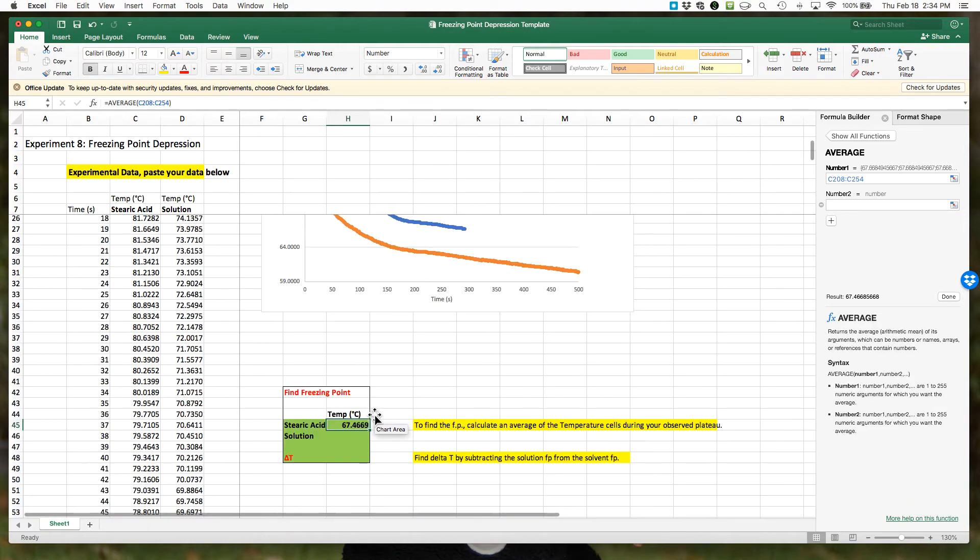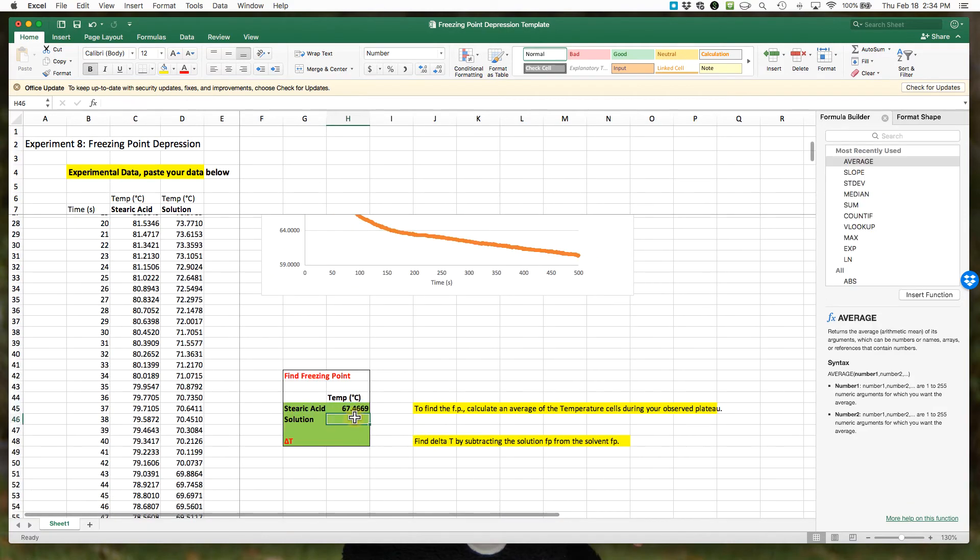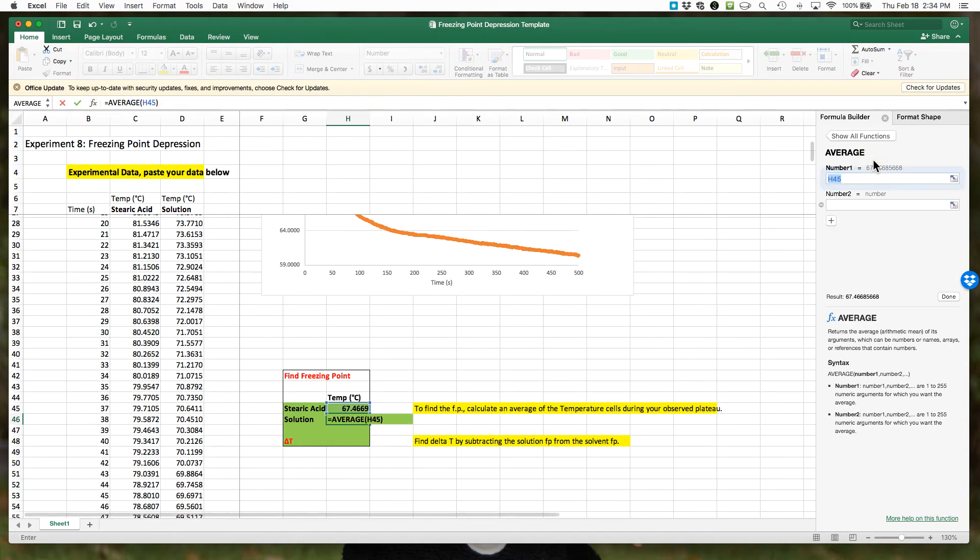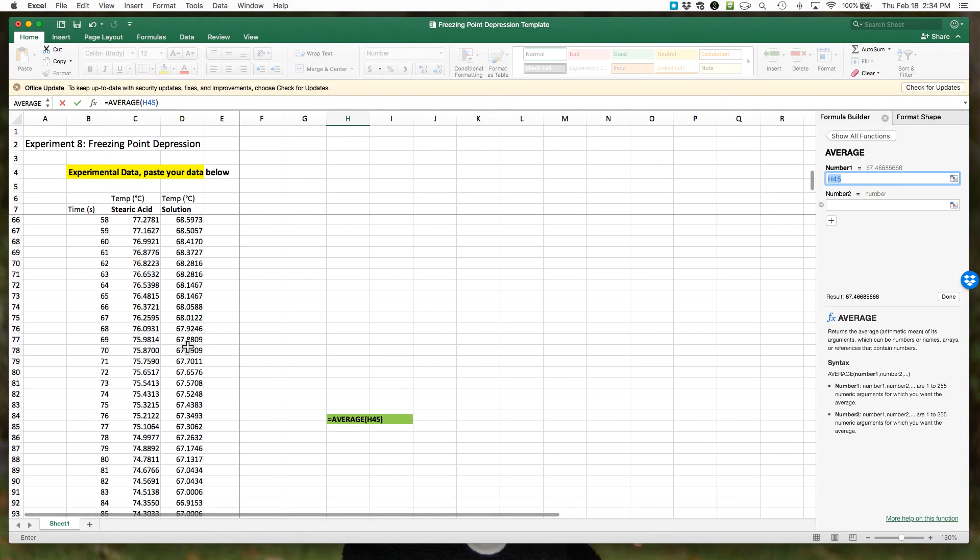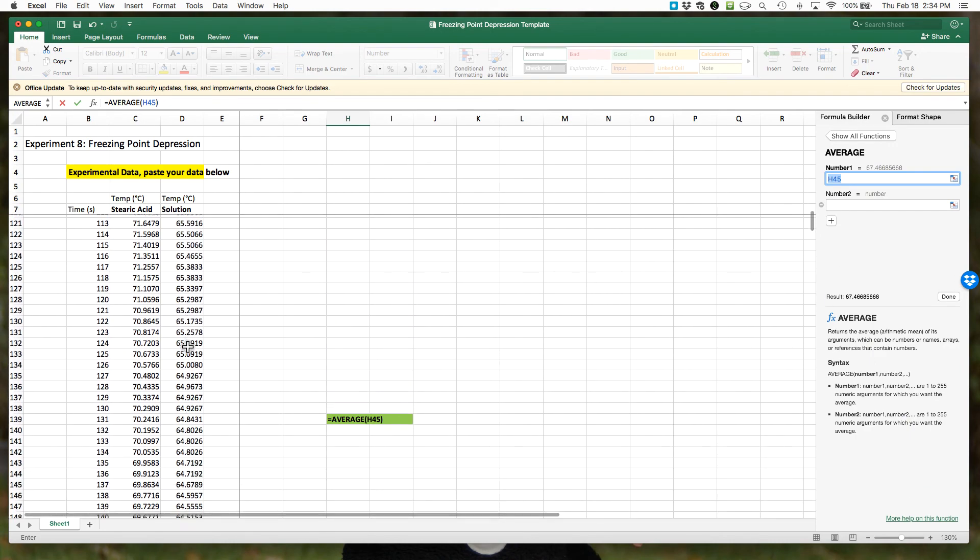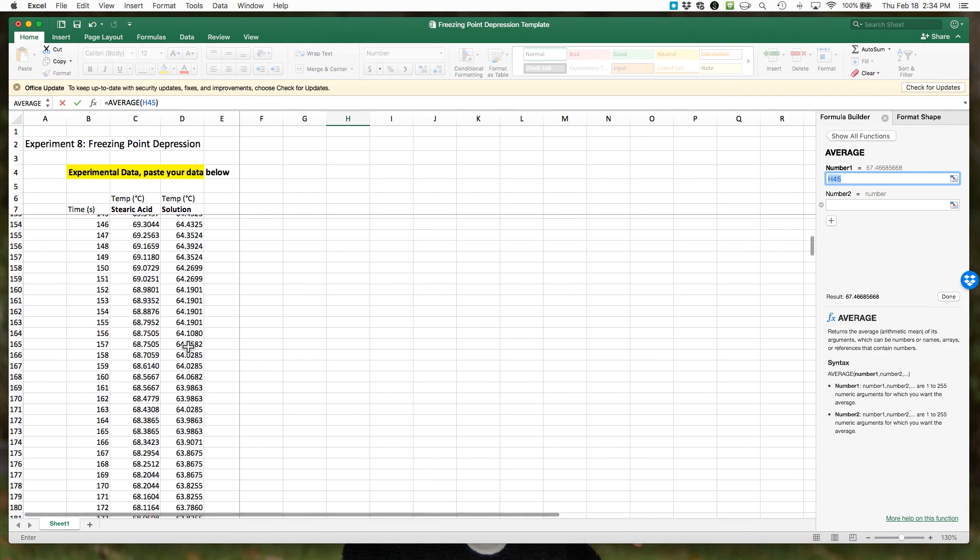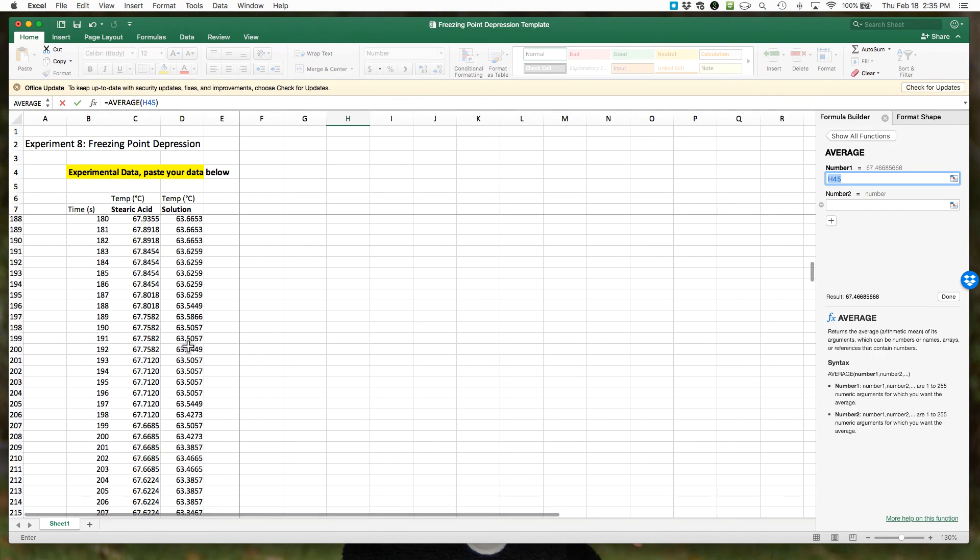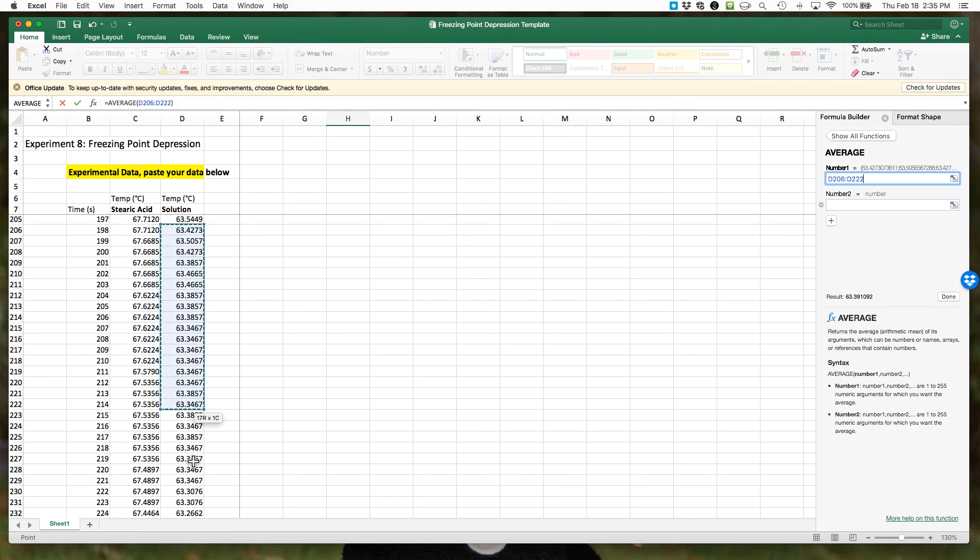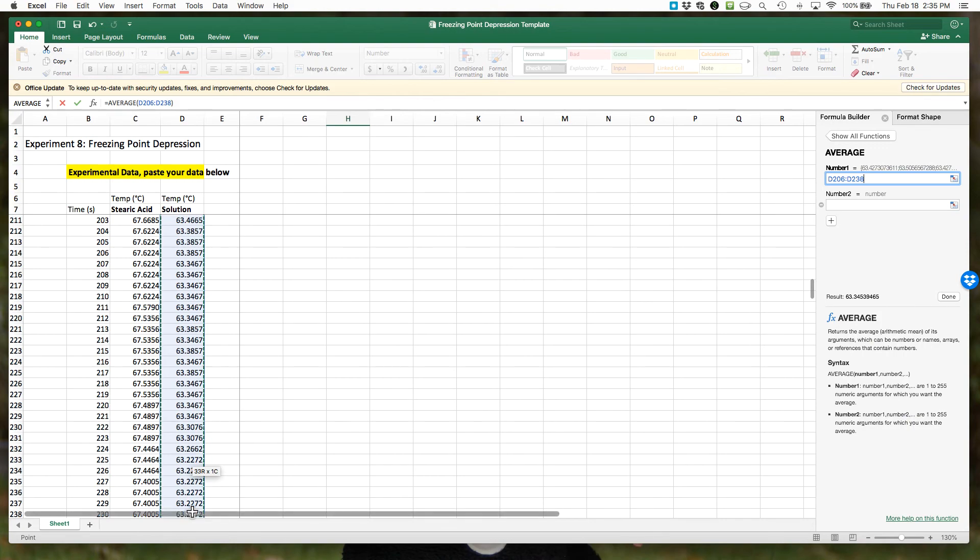Hit equals, and then we need a function. Double-click Average. Now we want to make sure we're taking our column D delta t. Again, we want to scroll down until we have the data for 198, and we're going to go to about 231 or thereabouts. Hit equals, and here's our freezing point.